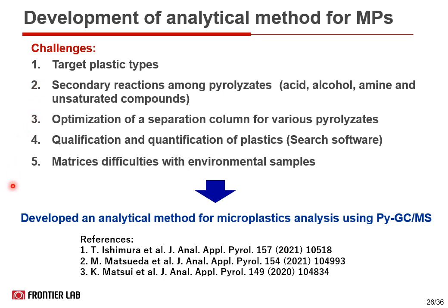So we overcame these challenges and developed an analytical method for microplastics analysis using the Py-GCMS system. The details are reported in the journal papers here. If you are interested, please find more information.